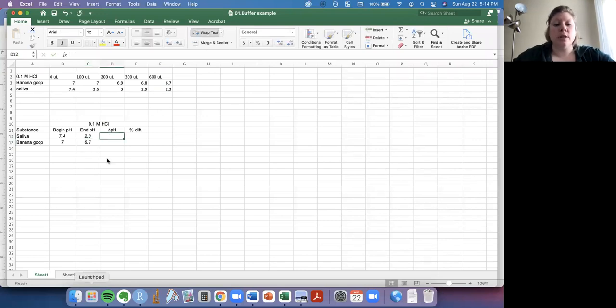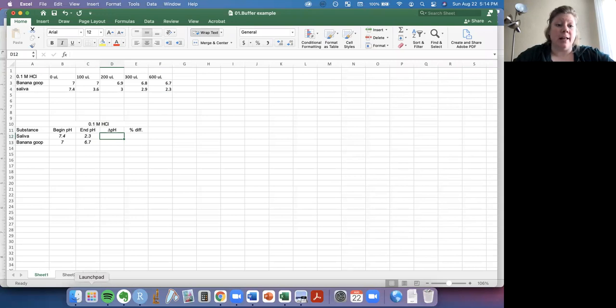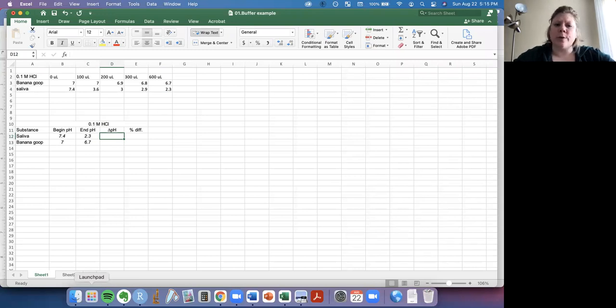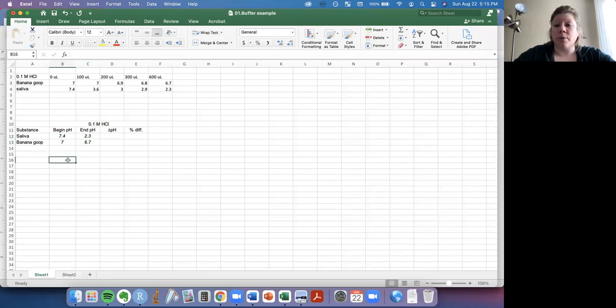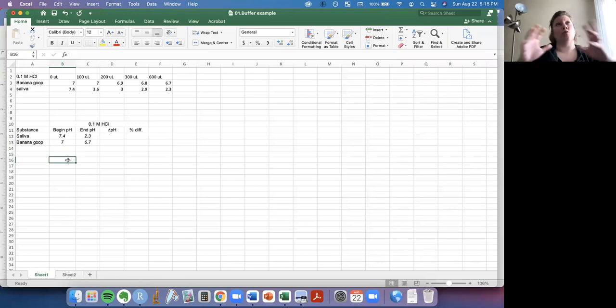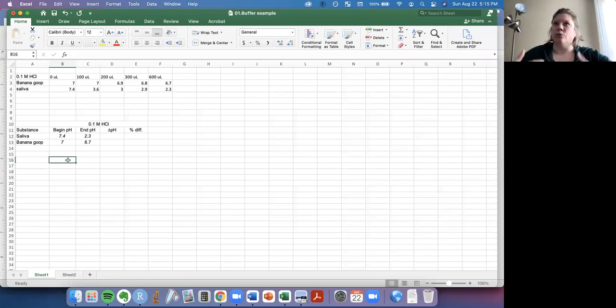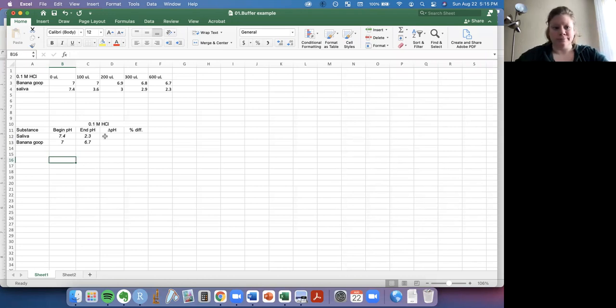And now we want to look at how the pH changed. And this is just to be able to calculate the percent difference. The reason we're going to do a percent difference is because these two substances aren't starting at the same pH. And so we want to look at the relative difference rather than the absolute difference with subtraction.